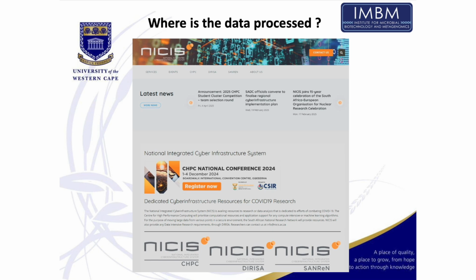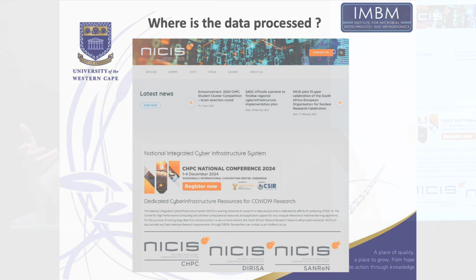So where do we do the data processing? If your data set is pretty small, you can do it on a local, pretty powerful laptop even, or a powerful desktop computer. One thing that happened quite early on with Oxford Nanopore is that they farmed these machines out to academics all across the world to test the technology.